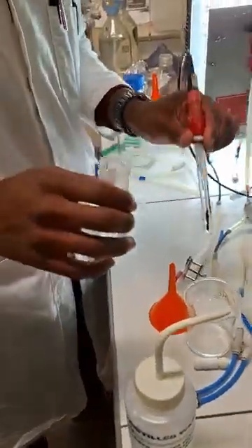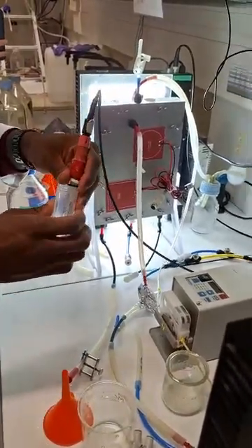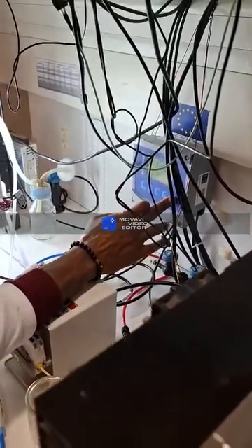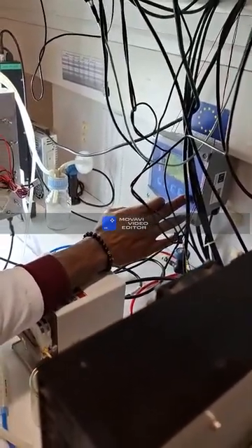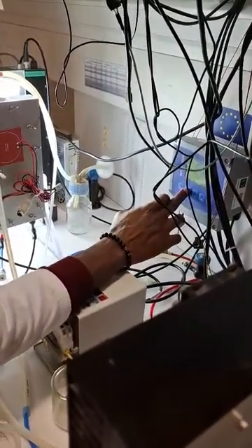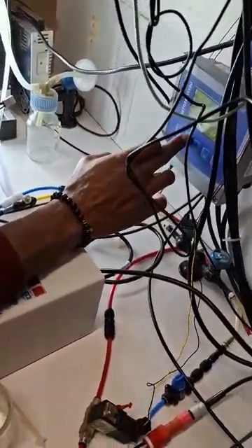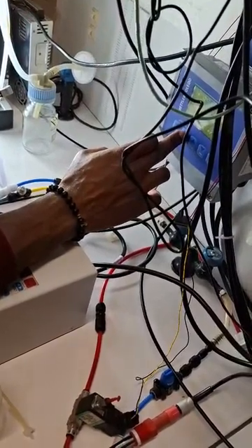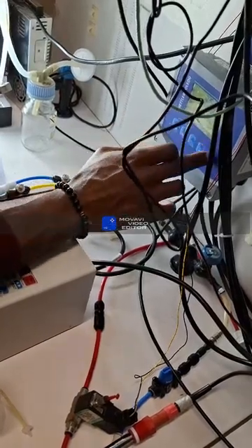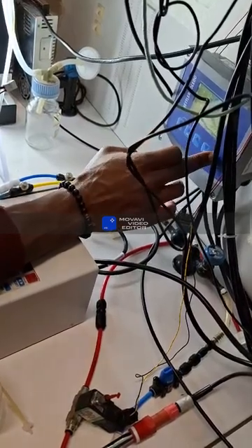Now we have to adjust by 4. And after, pH 4. So pH, enter. 1 point. It's okay.